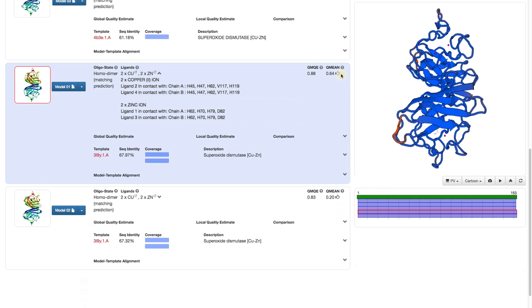Well, first of all, we built a model. This means we do not know what the correct structure really looks like. But we still want to know how good our model is.